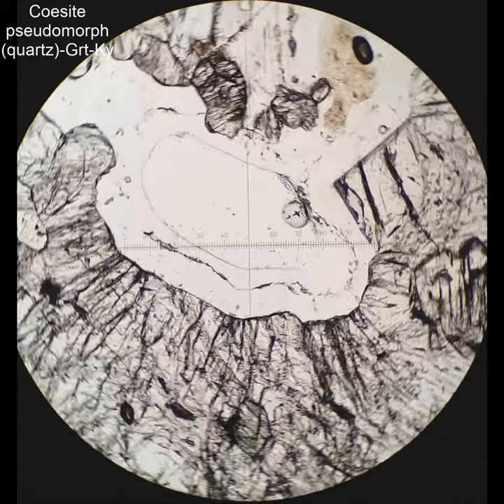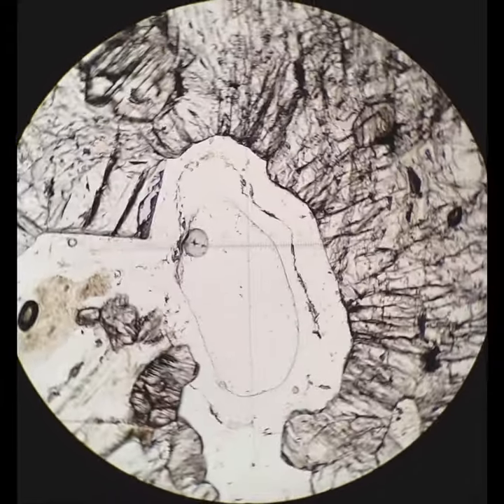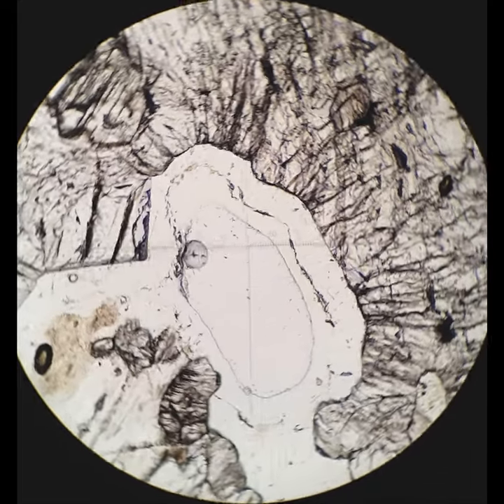This is a higher magnification view of one of those pseudomorphs. It's epoxy in the middle. There's a ring of quartz, and then there's garnet around the outside.